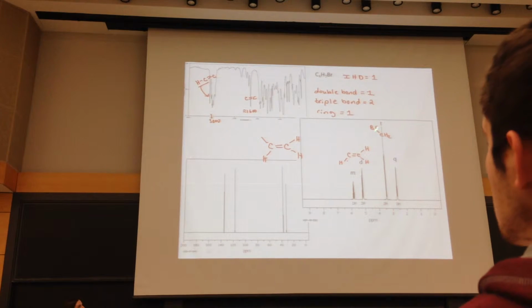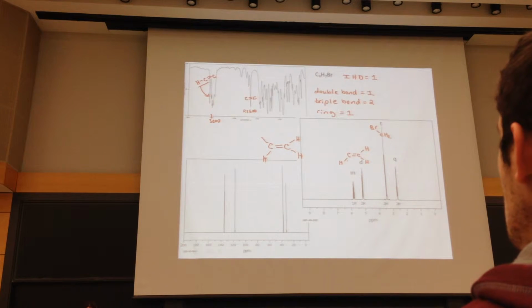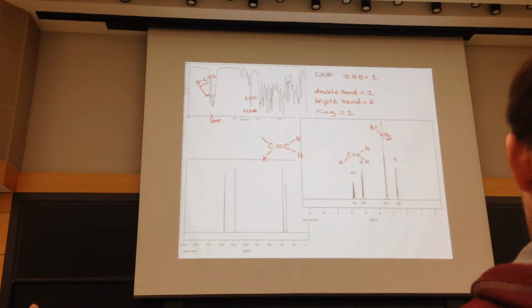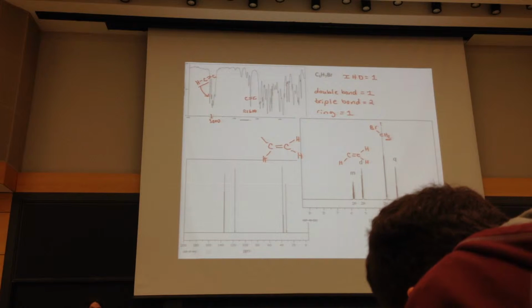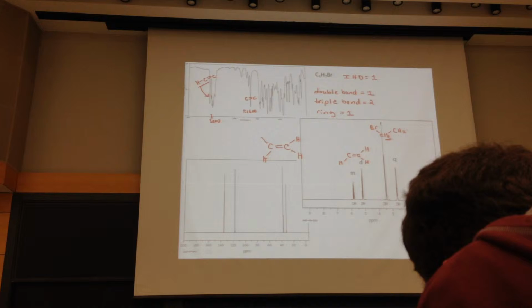If you have something, and we're going to talk about this triplet in a second, and it's a part of a chain, either box in or underline the protons that the signal represents. What does the triplet tell us? This is my n plus 1 rule. Triplet's 3. I have to go backwards. 3 minus 1.